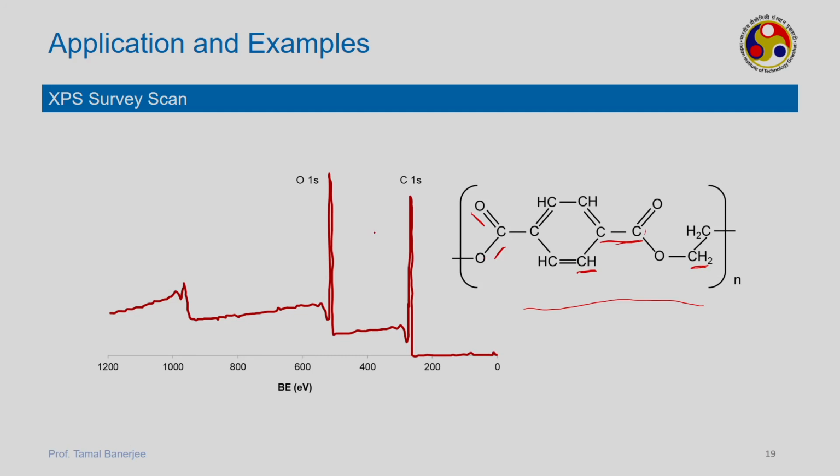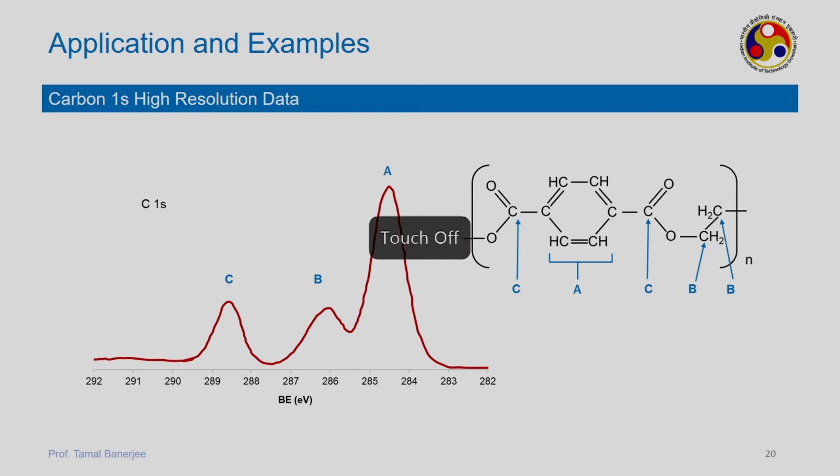So you can tell what sort of attachment the polymer has, and whether that attachment is fair enough. Fair enough means you compare the binding energies to the individual C-O, which I have already placed in the earlier lecture. You will compare the C1s orbital energies and the O1s orbital energy to find out whether the polymer is really formed or not. So if I want to distinguish the entire region, this is how it looks.